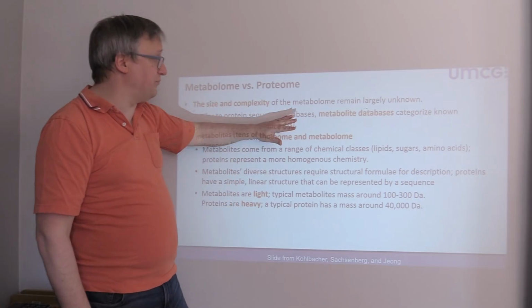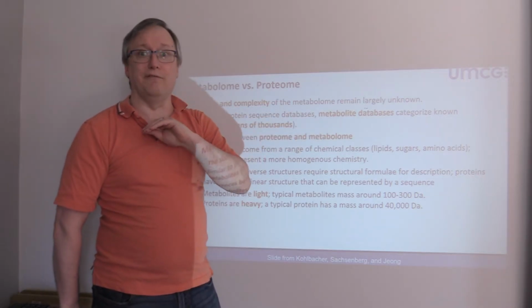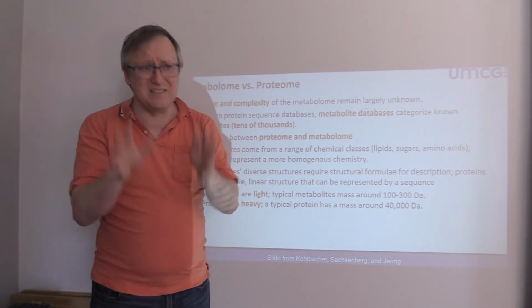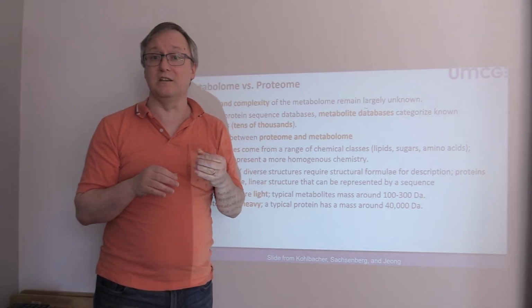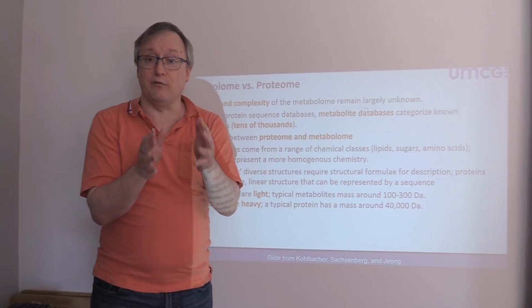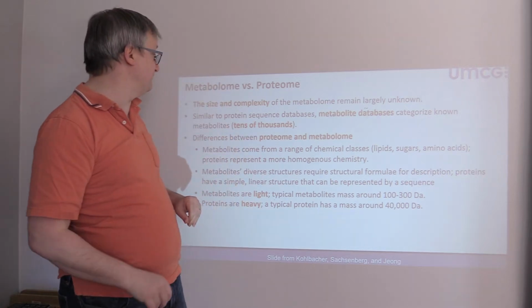So metabolite databases, if formed virtually, can contain easily tens of thousands of molecules, and if you have something like a spectral library accompanying it, at least some of those structures will be paired with a prediction of what ions should be seen if you were to fragment this metabolite.